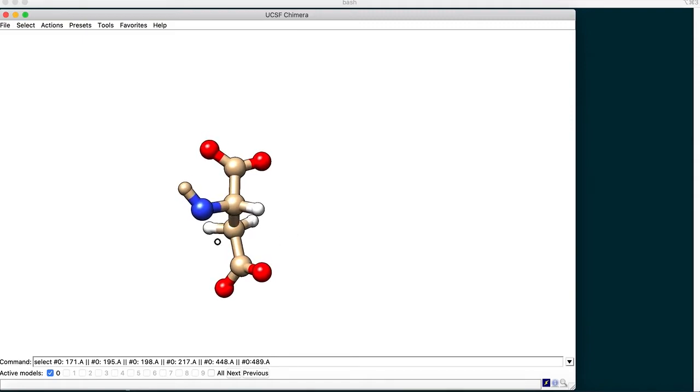So as you can see, we have almost gotten it in position. This is the C-alpha carbon, this is the nitrogen slightly on the left, and this is the carbonyl group, or the carboxylic group. If you go from here in the clockwise direction, you have the carboxylic group first, and then the alkyl group, because this is a methyl group attached to the carboxylic group, so this is an alkyl group or the R group, and then you have the N. So this is in the clockwise direction, and we can confirm that this is actually the L configuration.